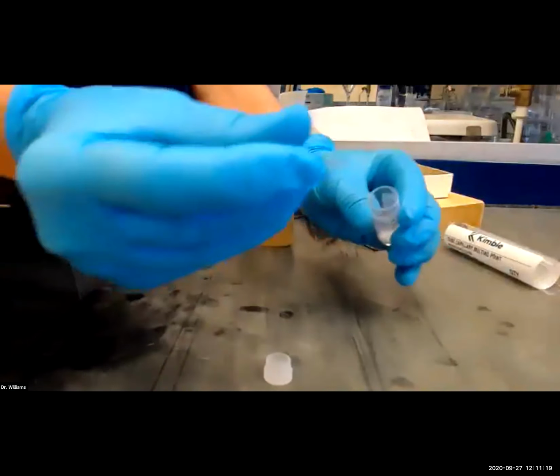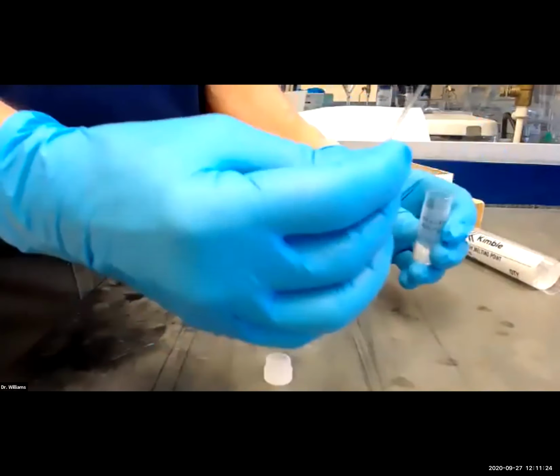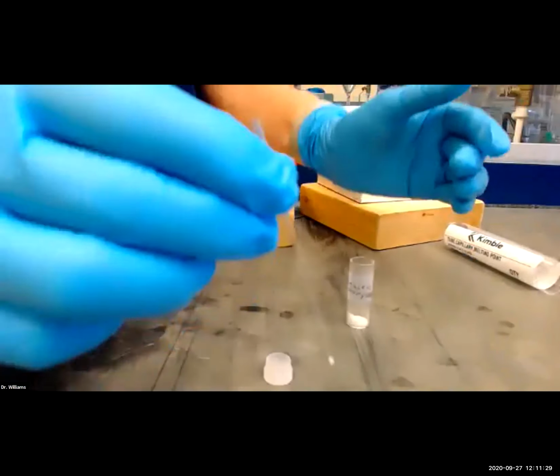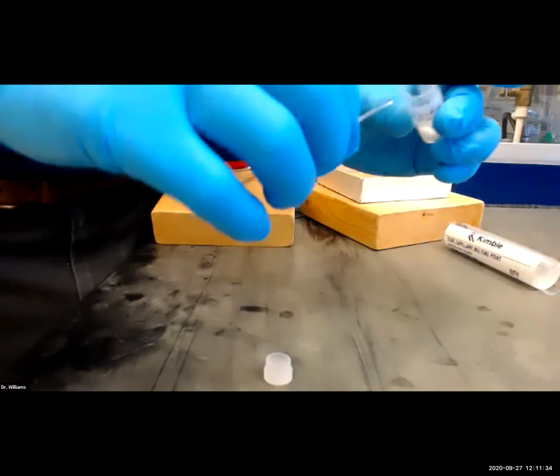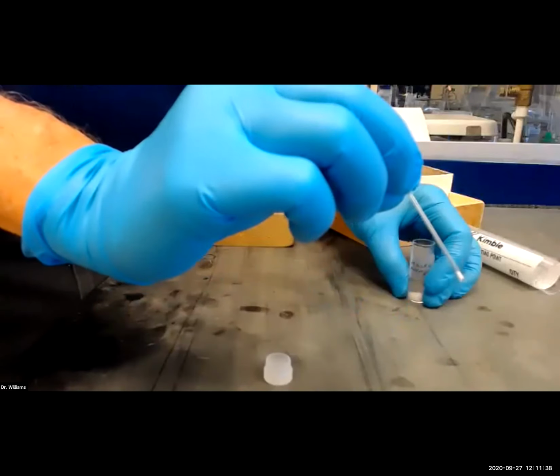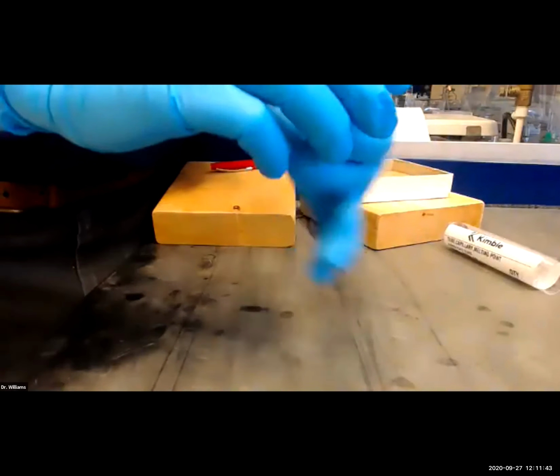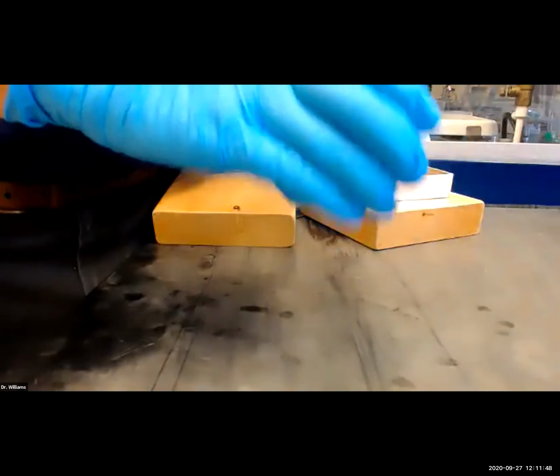That's one sample. I'm going to make up another sample on both of the instruments. Now, if the sample sticks to the sides and doesn't go into the tube, that means it's probably a little damp. It's probably got some moisture in there. So ensure your sample is completely dry before you try doing this. Looks good. So I've got the 2 samples prepared. Lid goes back on the container. Make sure this doesn't get spilled.